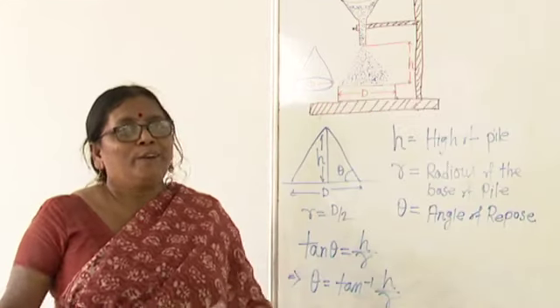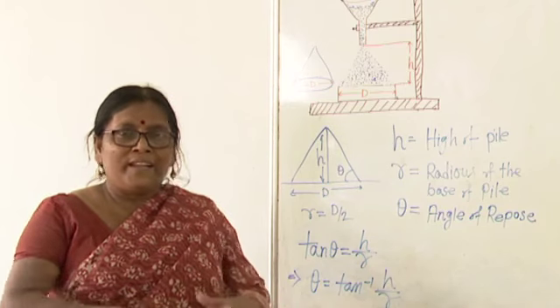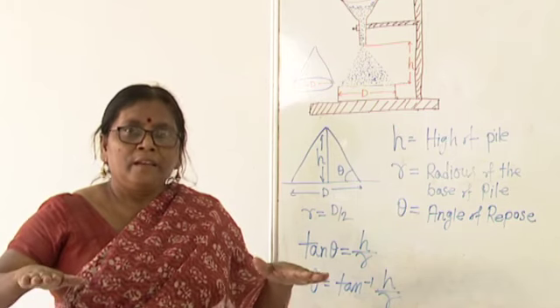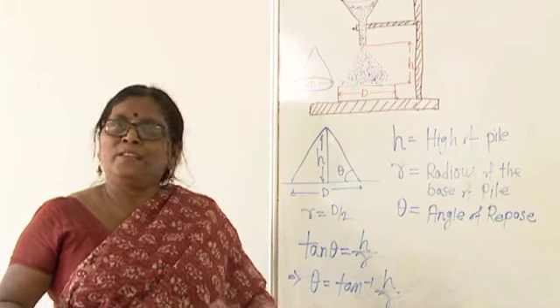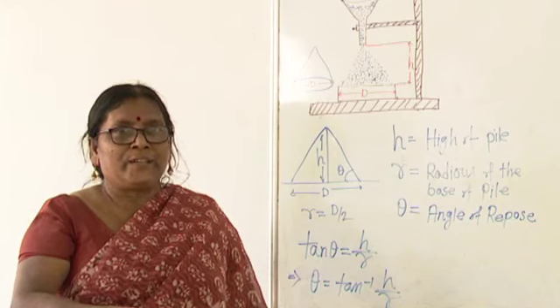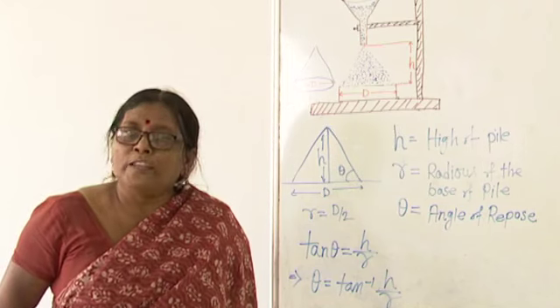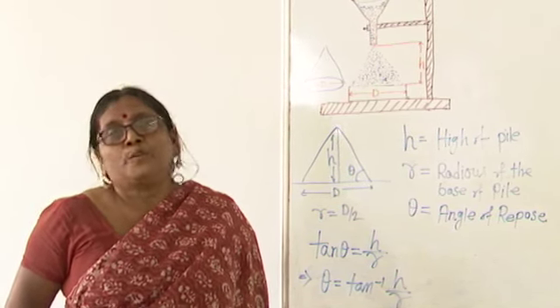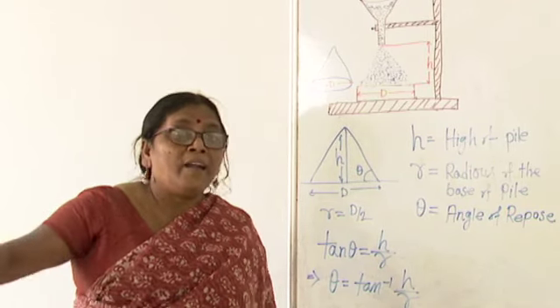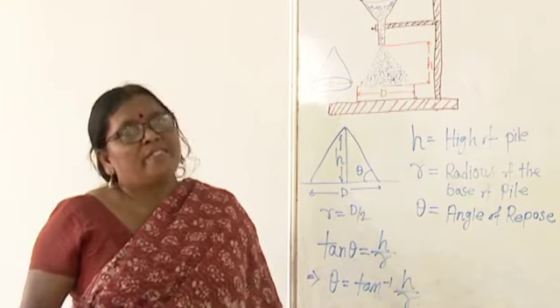So you see, what we got is a slanting surface. Initially, the particles made a bed. They could flatly hit the ground and flow easily. There was nothing to restrict their flow. But the particles coming later through the stem did not have the advantage of hitting the ground. They will fall over the already fallen particles. So now the particles which are already there and the particles which are flowing according to their inertia of motion, there will be an interaction.